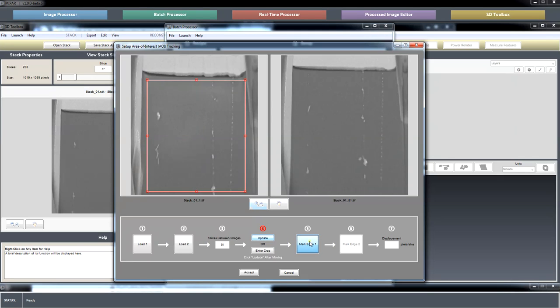So we've set up our first area of interest, and we're going to mark some fiducial marker. I like to use the corner of a face here. Press enter, and then mark edge 2. Try to mark the same feature in a slice 50 slices later. And now this calculates, it says you've got about a pixel drift up per slice, at least between slices 1 and 50, and we expect that movement to be consistent throughout the series.